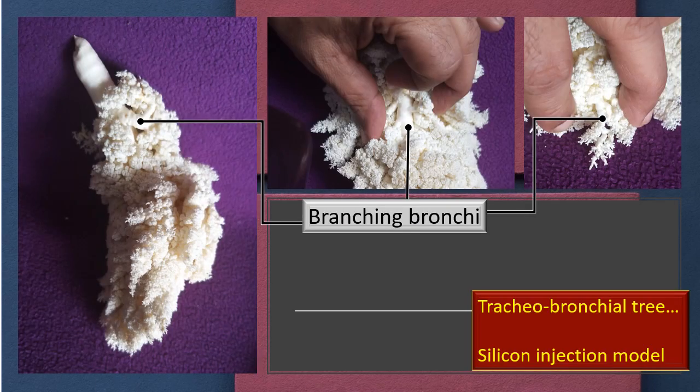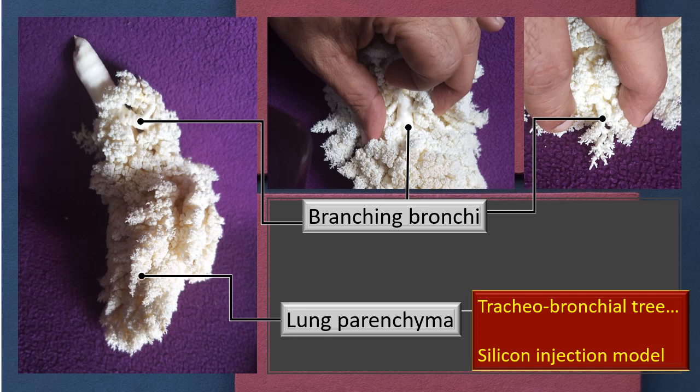Let's examine a few spots in this tracheobronchial tree to understand the branching pattern. Most textbooks describe a dichotomous branching pattern. I am showing you select spots where the branching of the bronchial tree is very clearly visible. At the very ends, in the extreme areas, I have labeled it as lung parenchyma — meaning that area plus all the surrounding tissues in the immediate vicinity combined we call the lung parenchyma.